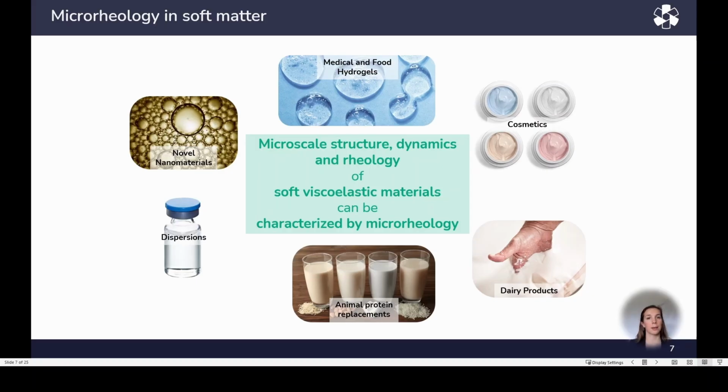Microrheology methods measure, as already mentioned, thermally driven motion of particles embedded within the sample over time. The analysis of this motion provides valuable insights into the microstructure, dynamics, and linear viscoelastic properties of soft materials and complex fluids, including colloids, foams, gels, and emulsions as found in cosmetics, dairy products, or special chemicals.